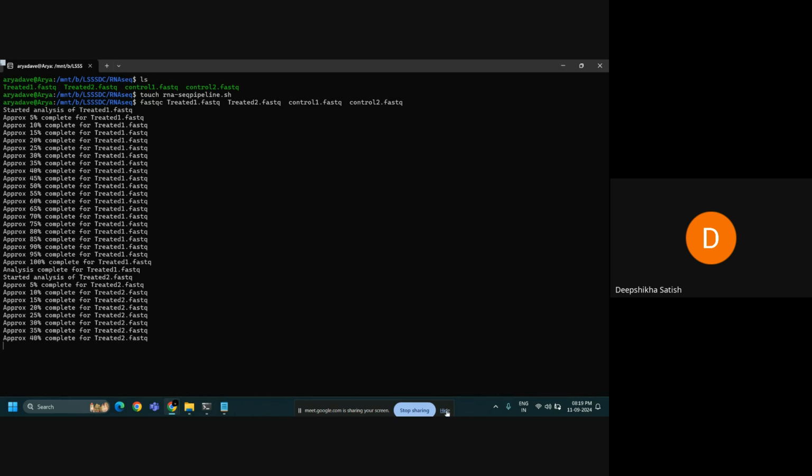It has been done for the treated one. It is doing for the treated two. Likewise, it will do for the control one and the control two. When it is done, okay, then let me know.